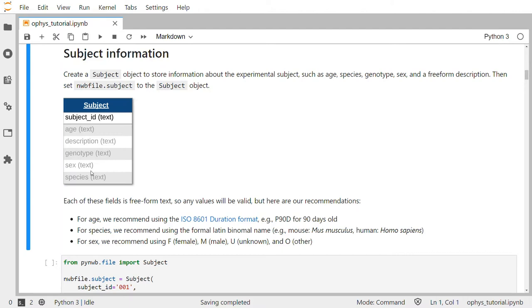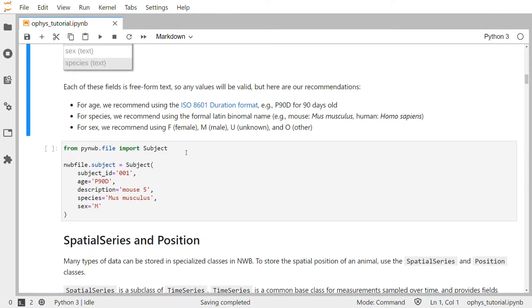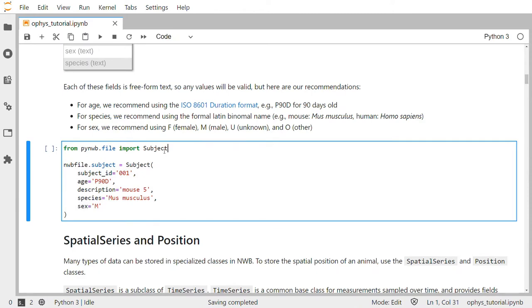For age, we recommend using the ISO 8601 duration format — for example, representing 90 days old as P90D, basically P, a number, and then a character representing days, months, weeks, years, etc. For species, we recommend using the formal Latin name, for example Homo sapiens for humans. For sex, we recommend using F, M, U, and O. In PyNWB, we import the subject class from PyNWB.file, call the subject constructor, pass in various keyword arguments, and then store the newly created subject object into the nwbfile.subject field.